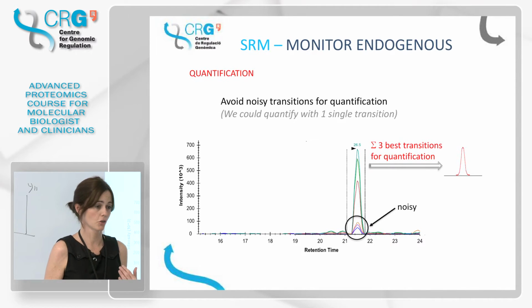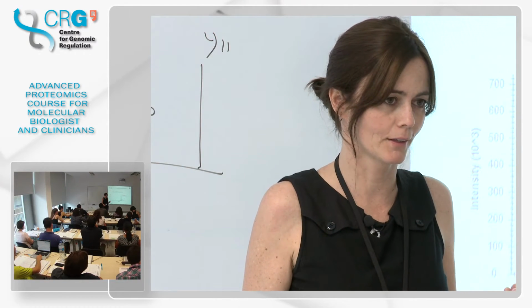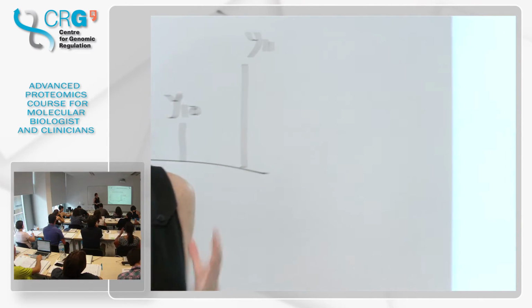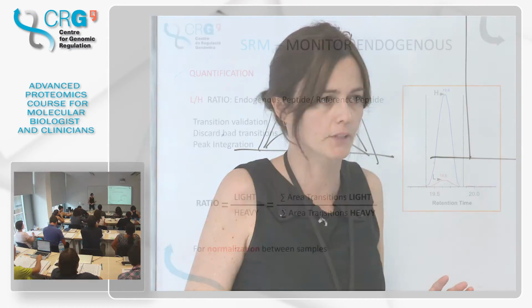For identification, obviously, never only one transition, because it's too little to be confident. There are too many coincidences. But once you are sure that that is your thing, you can use the best for quantification.